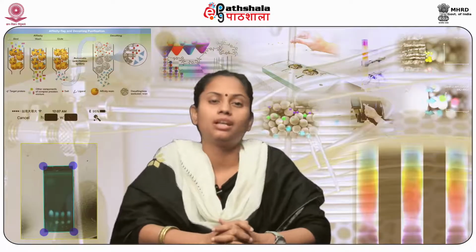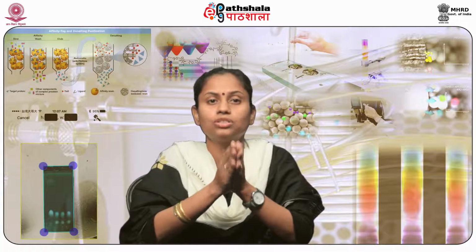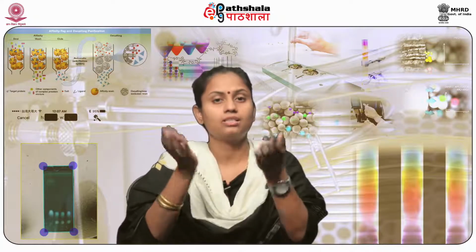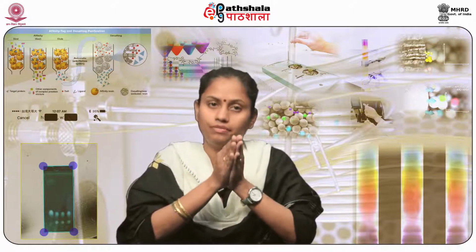So first, let me start by telling you what chromatography is. Chromatography is a technique for carrying out separation of a mixture of compounds into its individual components. Now, there are basically two phases involved in chromatography. First, a stationary phase, and second, a mobile phase.